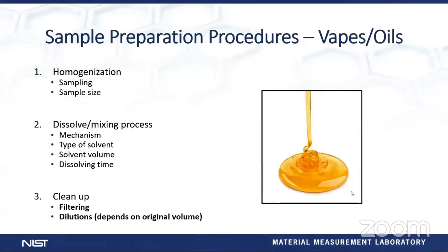Next, we wanted to look at the cleanup for it. Now, here's an example of what one of them looks like. These are generally fairly purely cleaned up samples that you will find on the marketplace. So generally speaking, you're not going to see a lot of precipitate in it. And dilutions really center more around the target range that you're looking for in your analysis.